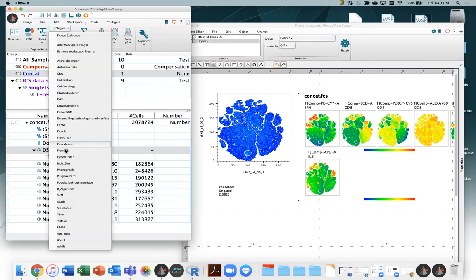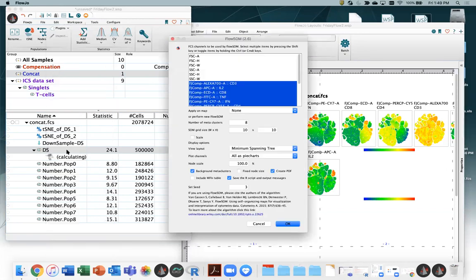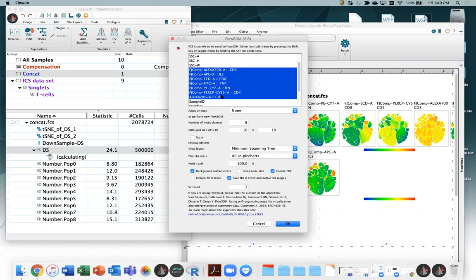All right, so let's throw FlowSOM on there first, since that was the one that we got the most requests for. All right, so again, FlowSOM, self-organizing map. The top portion here is just a selection of parameters. Ooh, I selected to export the uncomped CD3 and the comp version. Well, let's deselect uncomped. Okay, so I've picked the parameters I want to feed it.